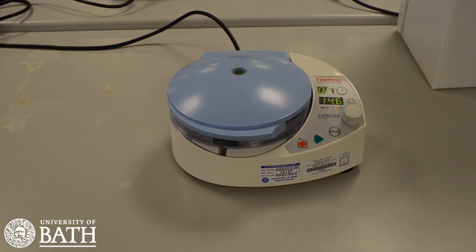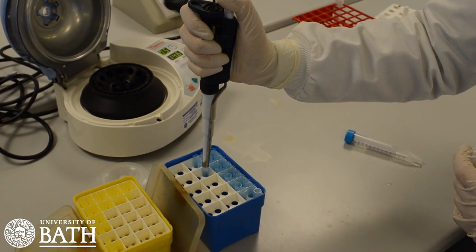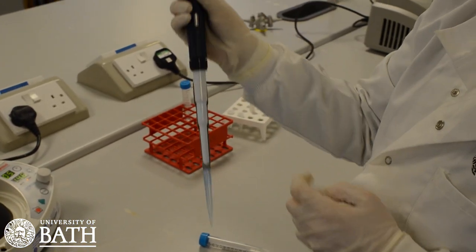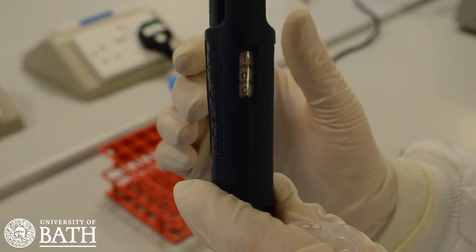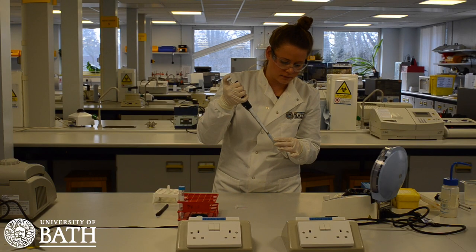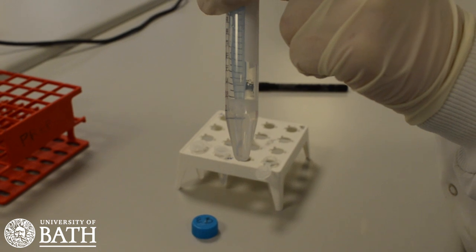A centrifuge will be used to obtain a concentrated sample of your cheek cells from the saline solution. However, the experiment can still be run without a centrifuge, so don't worry if you do not have one. Take the 100 to 1000 µL pipette and make sure that the tip is on the end securely. Set the pipette to 1 millilitre using the adjustment dial at the top. Using the pipette, take 1 millilitre of your expelled saline solution and place it into a microcentrifuge tube.